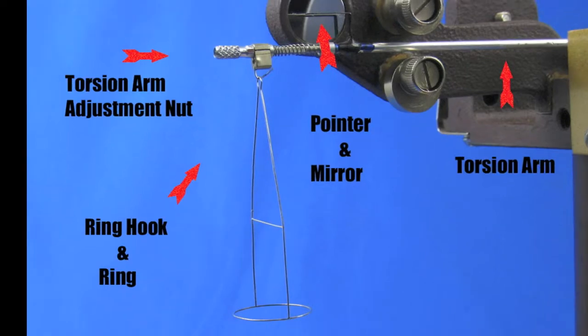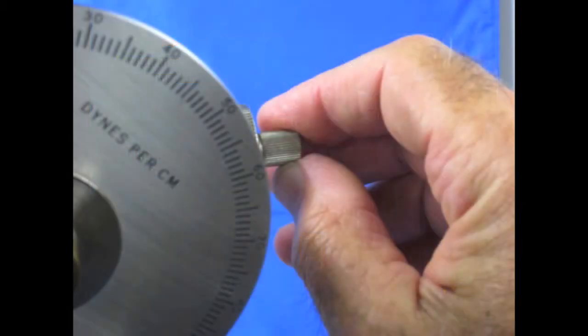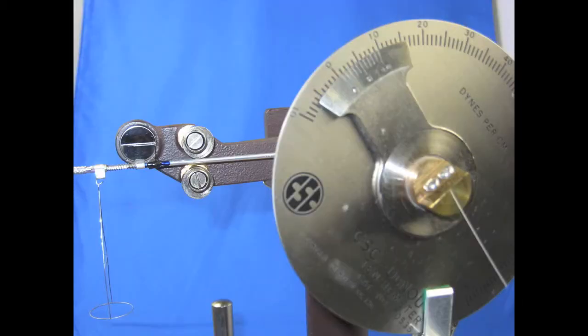This will move the torsion arm down to the stop. The next step is to move the arm pointer back to the line by turning the adjustment knob clockwise until the arm pointer lines up with the mirror line. Next, loosen the dial clamp and turn the dial until the dial zero line matches the zero line on the vernier.